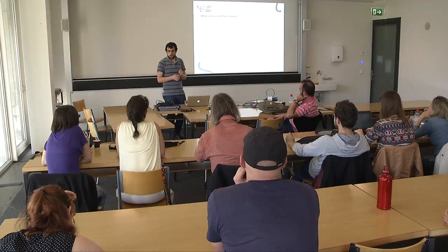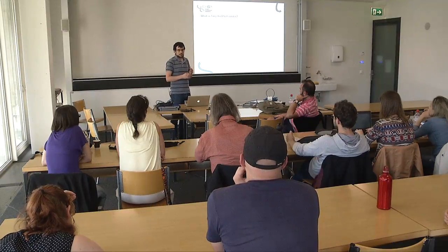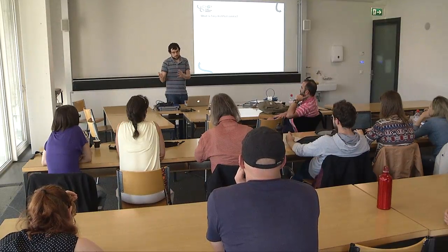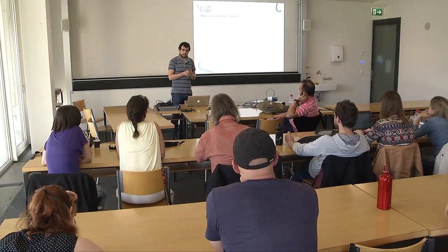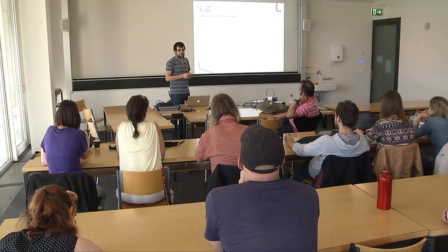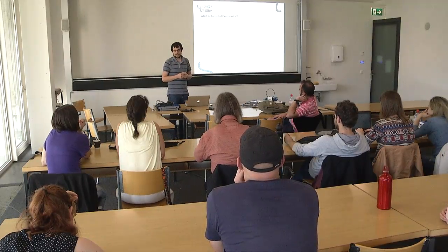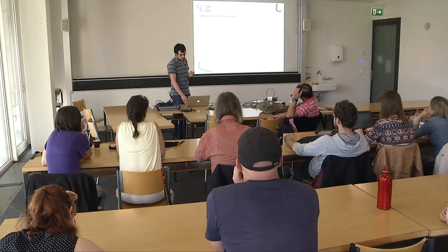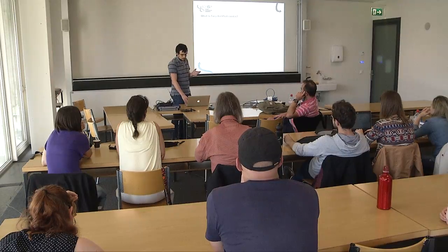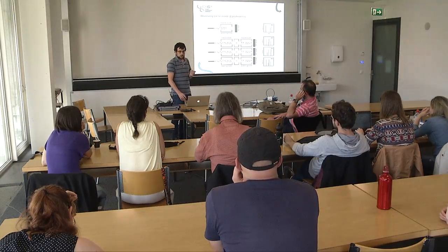Is shotgun proteomics, or top-down methods, targeted proteomics? Is SWATH or data-independent acquisition targeted proteomics? Okay. Before starting the discussion, I also wanted to maybe review the shotgun proteomics schema, right?